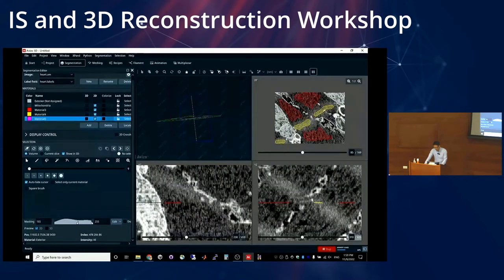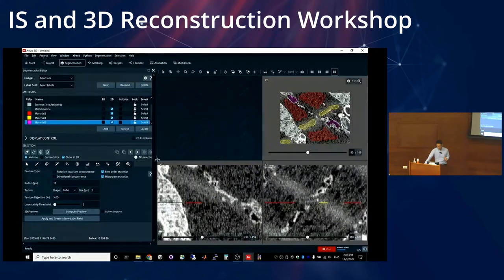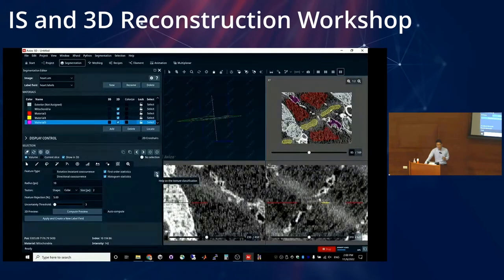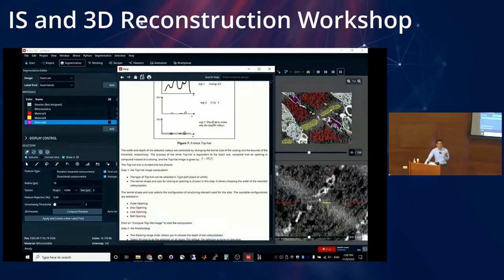And it's a mystery, because sometimes you have to use different combinations of filters, different pre-processing, post-processing, different techniques. All right. Okay. So let's say I'm happy with the selection that I made. Avizo will use this selection here for training, and then it's going to segment everything else. So I'm going to click this texture classification. All right. There's a bunch of parameters here, okay? I'm not going to go through all of them. If you're interested, you should click on this question mark to see the explanation for the different parameters, okay?